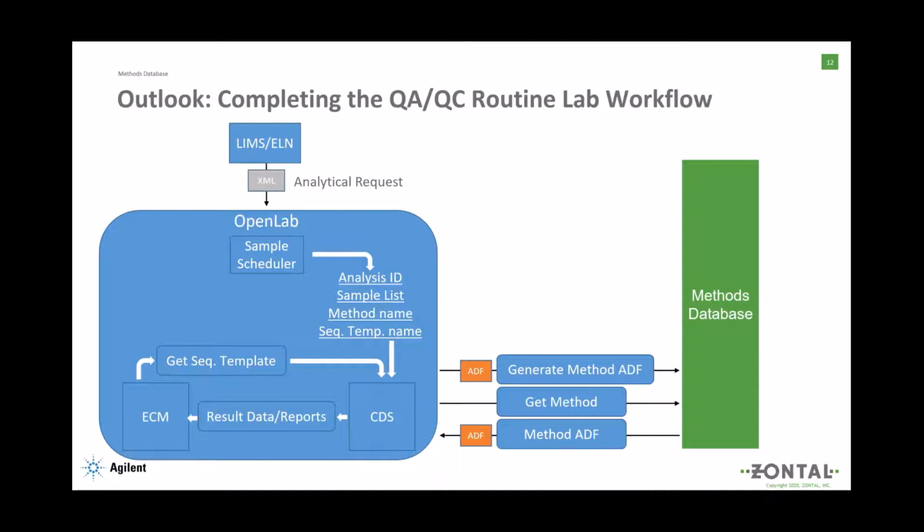And this information is typically sent automatically to the CDS if, let's say, it is allowed to transmit it in an automated way. So in Sample Scheduler, we have different modes of action. We have different states, we call this. So we have the automated, but also the waiting state as well. So this means if you have, for example, vials to operate and to bring, or a tray to bring to an instrument, you cannot have a fully automated shoot from Sample Scheduler to CDS. You have to wait until the tray is loaded.